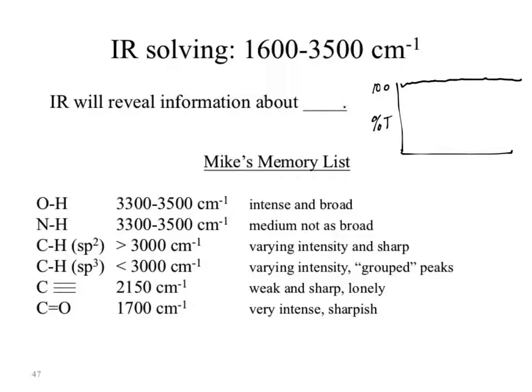If we now go through and look at a signal, what happens? How many peaks are shown? 2. But isn't there only one peak? Isn't that the only one peak? Okay. IR is read upside down-ish. Our peaks are here. Between those two, the first one is more intense than the second. Is the second one low intensity or medium intensity? I literally have no way to answer that question. That entirely depends on the situation and what you're looking at within the spectrum.